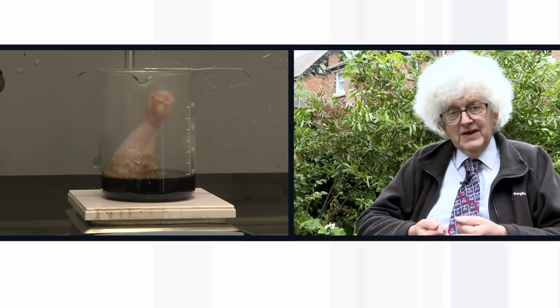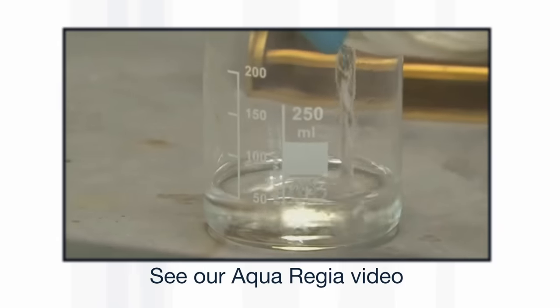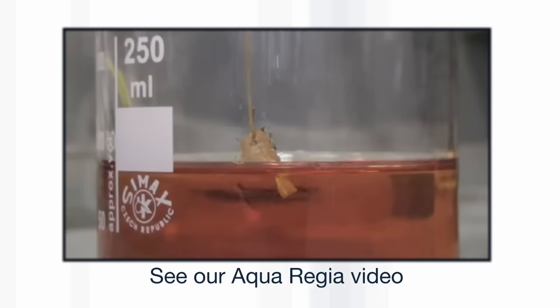I think it is a good demonstration of how when you use a mixture of chemicals, you can have a bigger effect than using either of the chemicals individually. We've seen this with aqua regia dissolving gold, where a mixture of nitric acid and hydrochloric acid will dissolve gold, but the two acids individually won't. It may be that in the Piranha Solution, there is a small concentration of so-called caroate acid, which is peroxysulfuric acid, which itself is a very strong oxidizing agent, and that might add a bit of extra wumpf to the reaction.